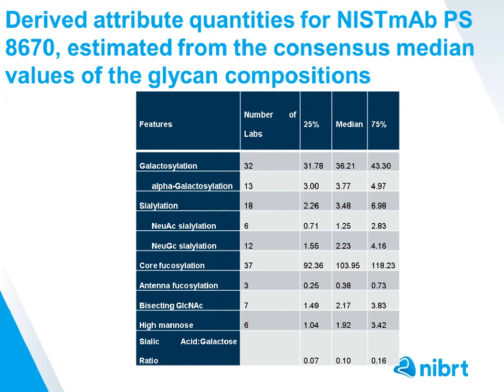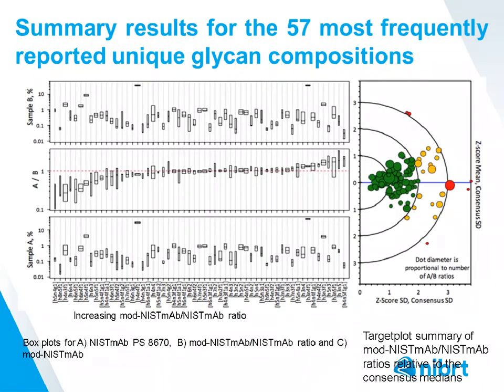Also in this paper, just to give you a highlight, if you're interested in measuring glycosylation features, there is a breakdown provided in this table. This might be important if, for example, you were creating a new monoclonal antibody and you wanted to make sure that you were characterizing low amounts of the immunogenic epitopes, such as NGNA, or N-glycolylneuraminic acid sialylation, or, for example, the alpha-galactosylation that I mentioned earlier. You might want to compare this monoclonal antibody to see what values you're getting relative to the community, and then use your own new monoclonal antibody. So this could be quite important.